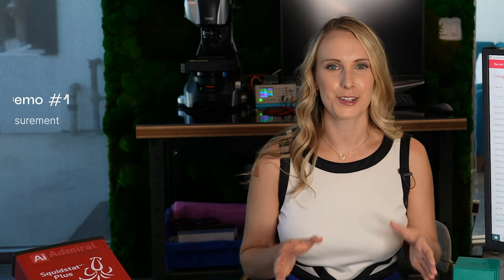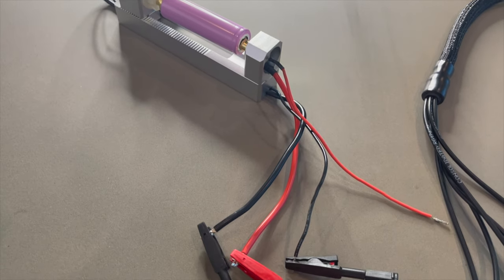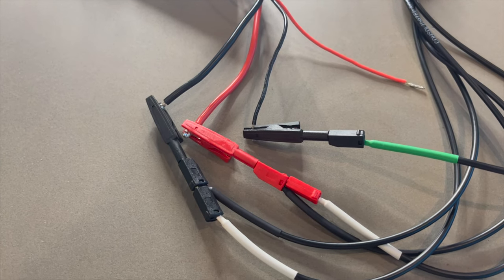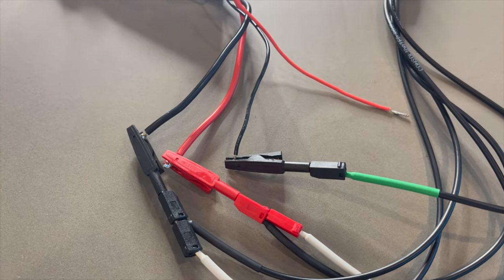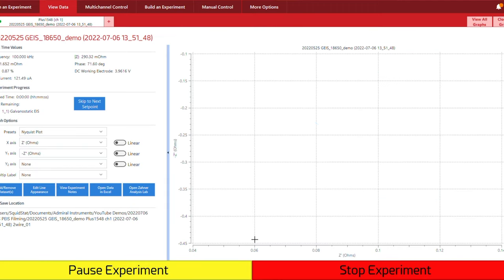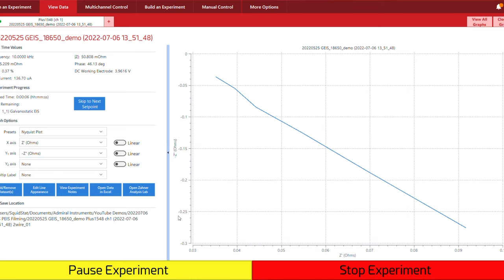The first demo that I'll show you is of the two wire measurement. You can see that I have the 18650 lithium-ion battery wired up in the cell holder to the two wire measurement. Notice how the sense leads are outside of the working electrode and counter electrode leads, and the reference electrode is tied with the negative terminal in the black wire. Now that I have this set up, I can start the experiment. And our experiment is running — that impedance is being mapped on the Nyquist plot.